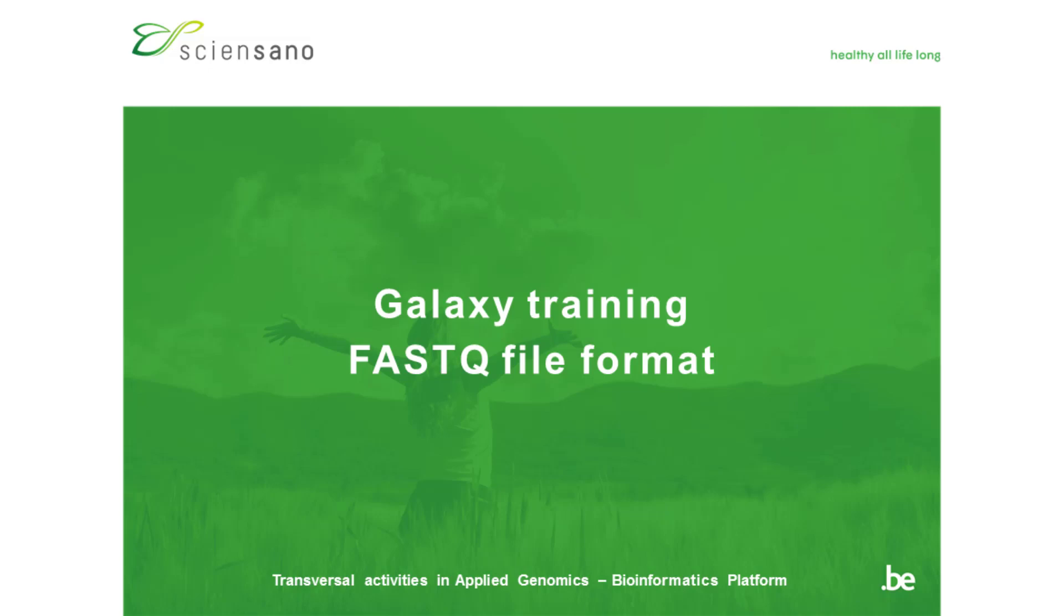In this video we will look at the file format that is used to store raw sequencing data. It's a text-based format so it's human readable and follows a certain structure.